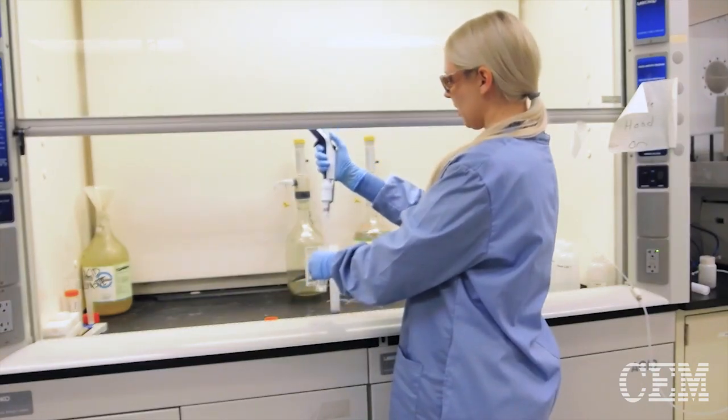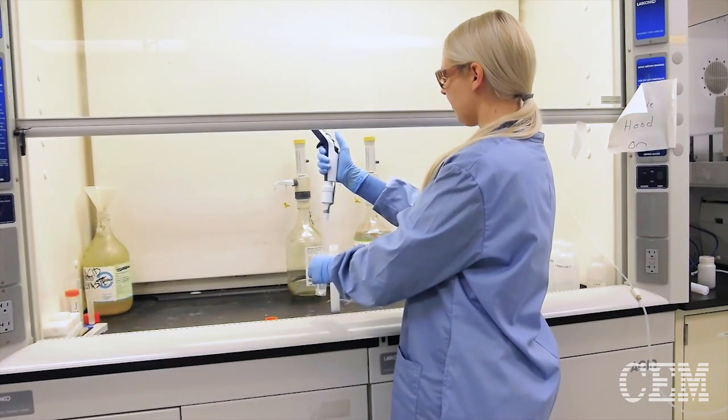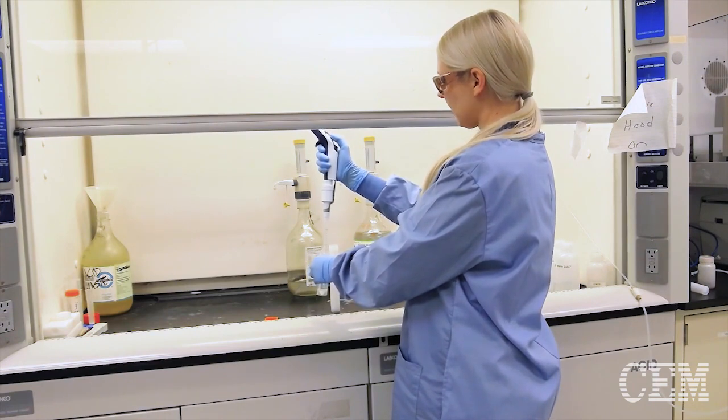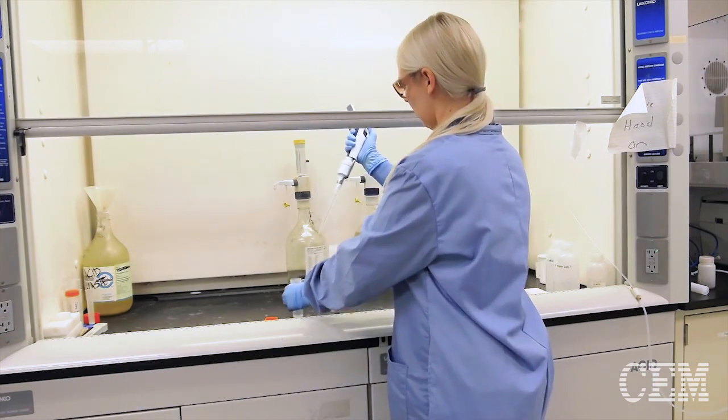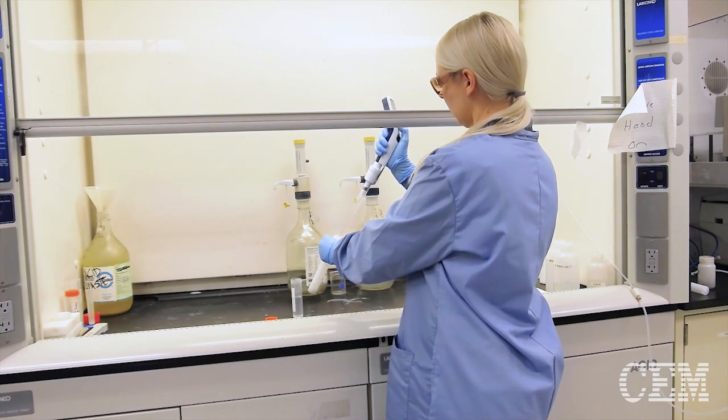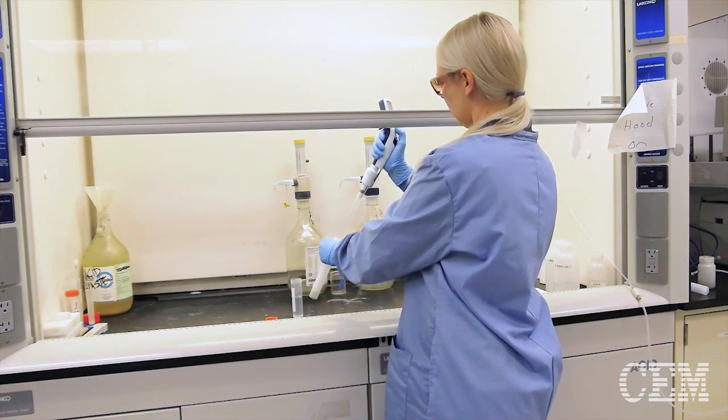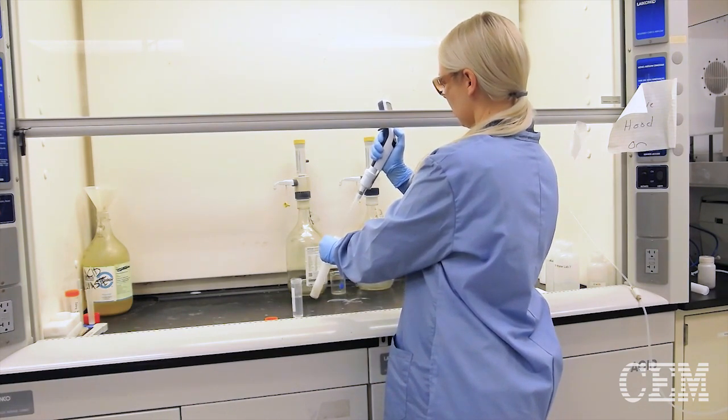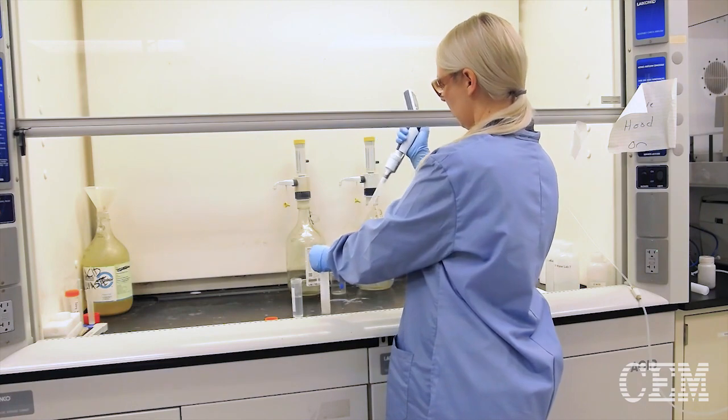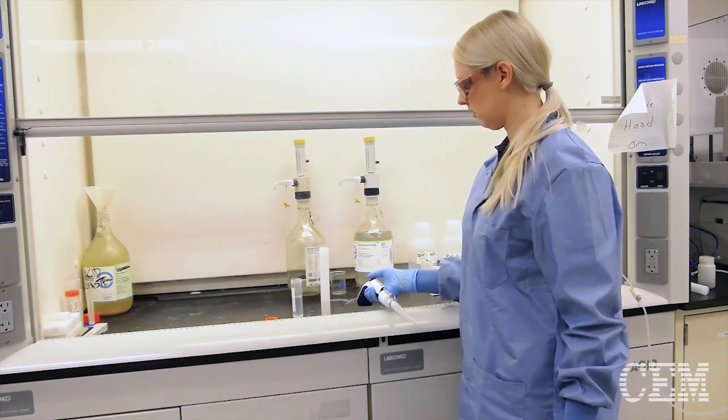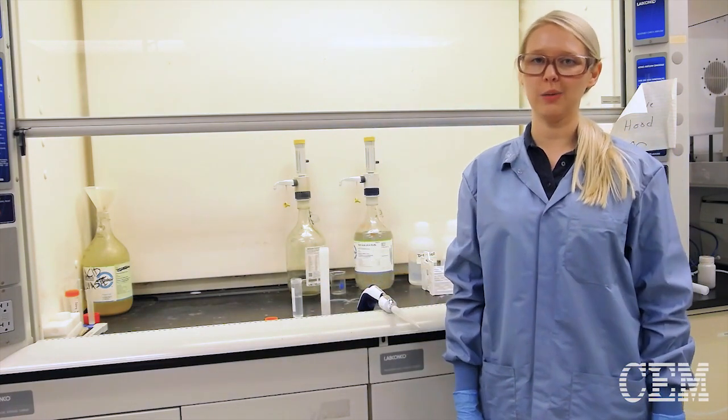You take your automatic pipette, get your acid, tilt your vessel, and just swirl around to make sure you're getting every angle of the sidewall to get the sample down to the bottom.